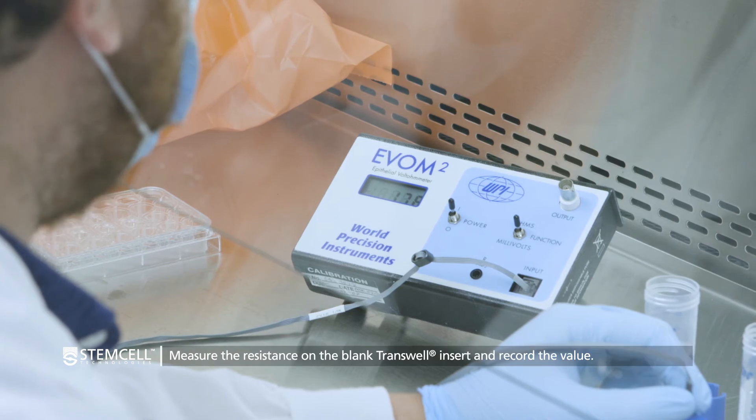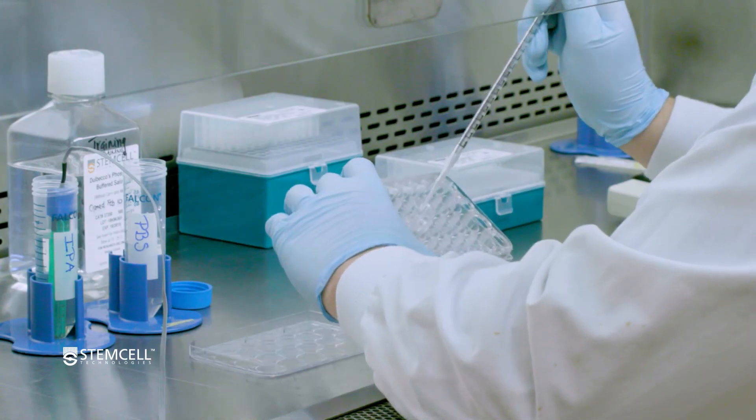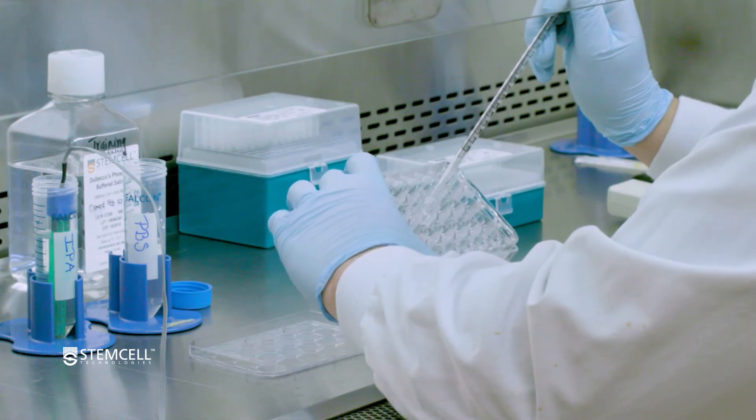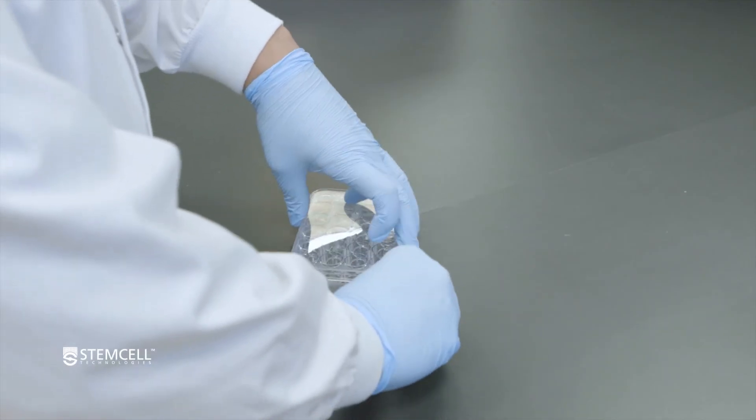Perform one final measurement on the blank transwell control, returning the probe to IPA once complete. Remove the PBS from the apical and basal compartments of the blank transwell and store it dry in a separate plate, ready for use for subsequent TEER measurements.